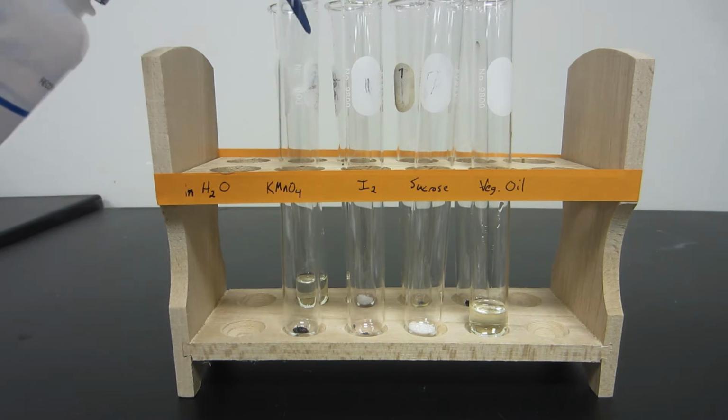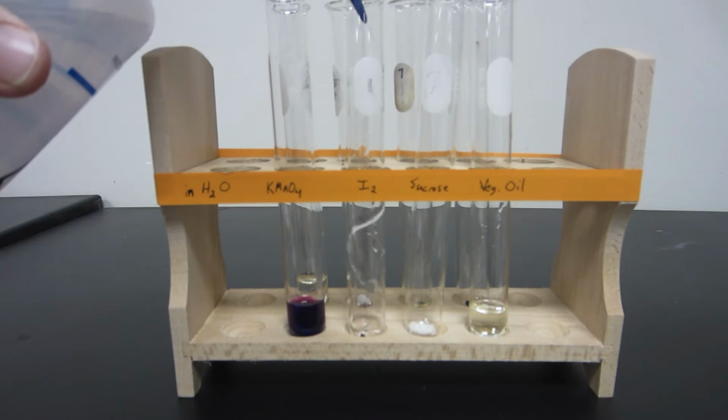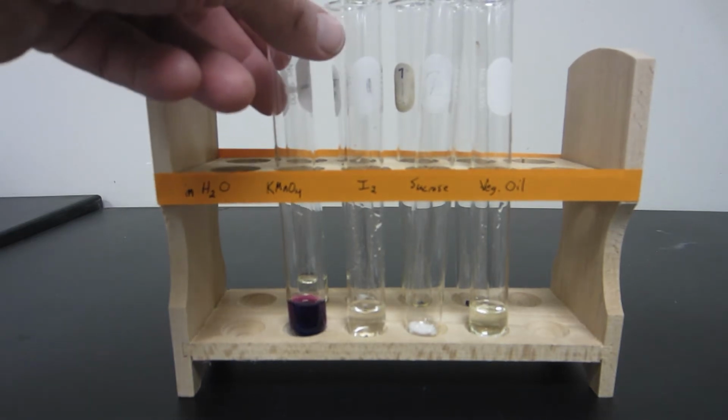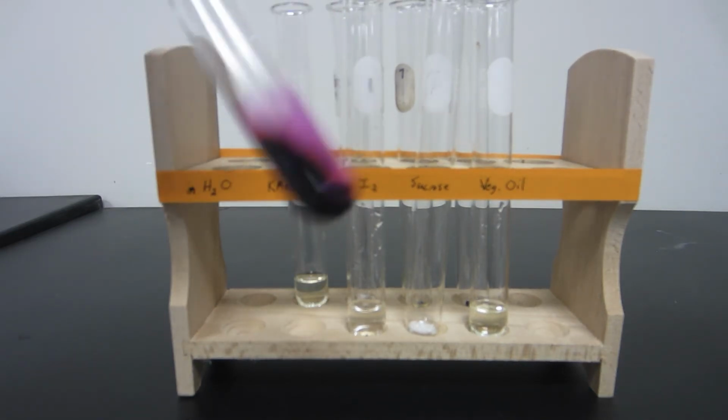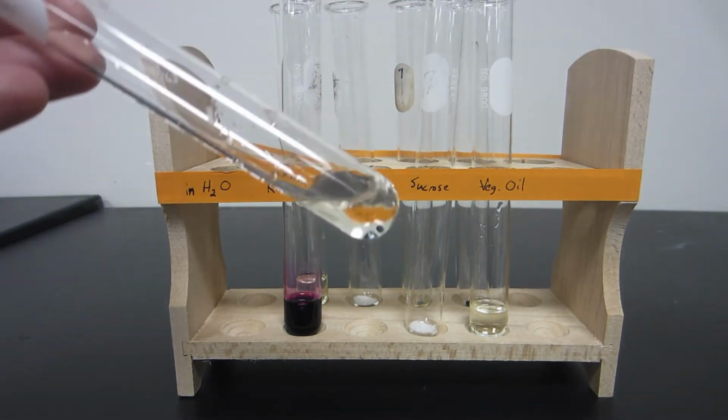Now for this part, I'm just going to squirt some water into each test tube. I think what you're going to be able to see pretty clearly is that the first two, potassium permanganate and iodine, are purple solids. We see the potassium permanganate has clearly dissolved in the water, producing a really pretty purple solution. Iodine, however, is not.